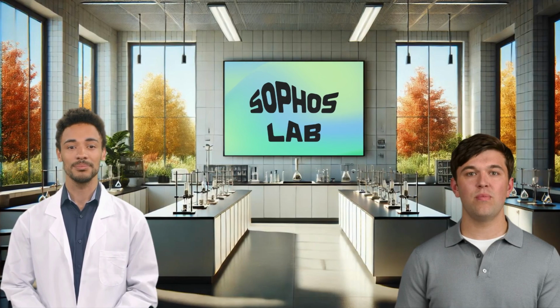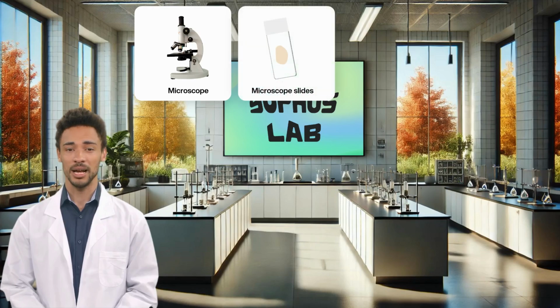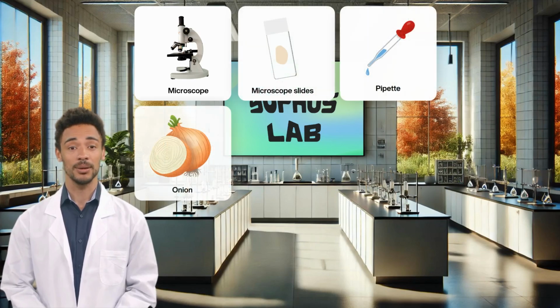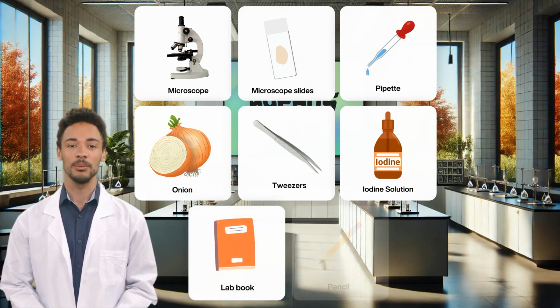On to the practical. Let's start by gathering our materials. Sam, what do we need? So for this practical, we need a microscope, microscope slides, a pipette, an onion, a pair of tweezers, iodine solution, a lab book, and a sharp pencil for drawing.